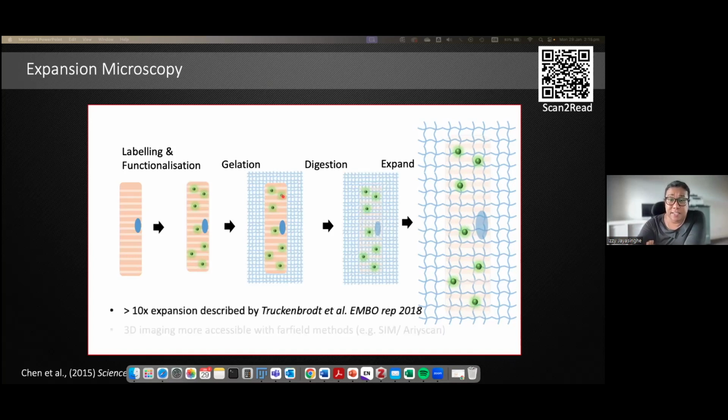And the final step is that you add water, which displaces sodium from the hydrogel and occupies the pores of the gel in a way that it expands. It can expand, depending on the chemistry that you choose, by a factor of 1,000 in volume or more.